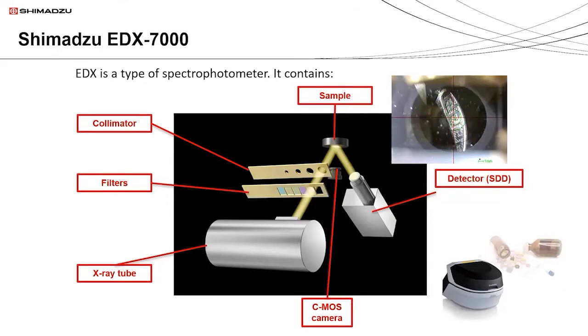And without getting too technical in detail of the science, the filters are really important in pharmaceutical analysis. What they essentially do is remove, decrease background that is resultant from primarily Compton scattering. Some people call it the anomalous scattering, but primarily X-ray scattering off of the sample, and thereby decrease detection limits.